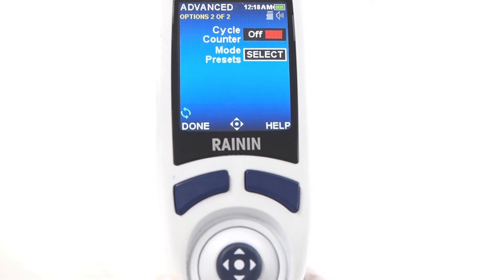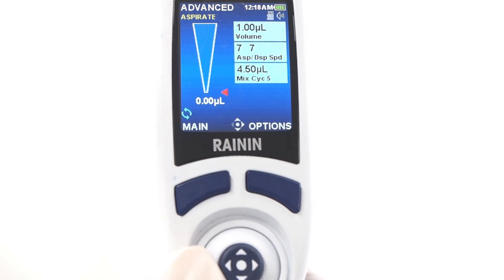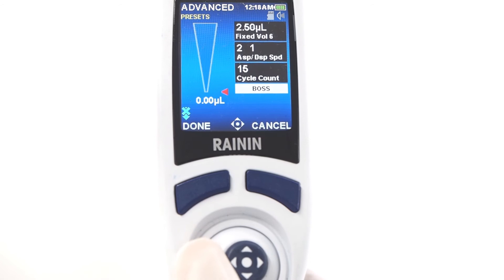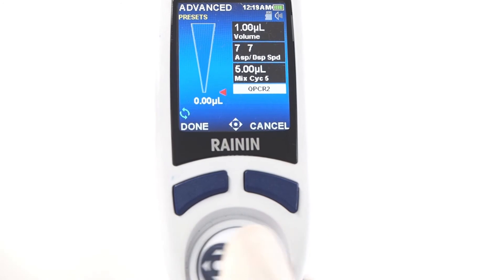Options also include mode presets, which give you a quick way to program a protocol. With any configuration of settings and options saved as a preset, you can glide between them, as shown here with the A preset, BOSS preset, and QPCR1 and QPCR2 presets. Notice how different the settings are from preset to preset.